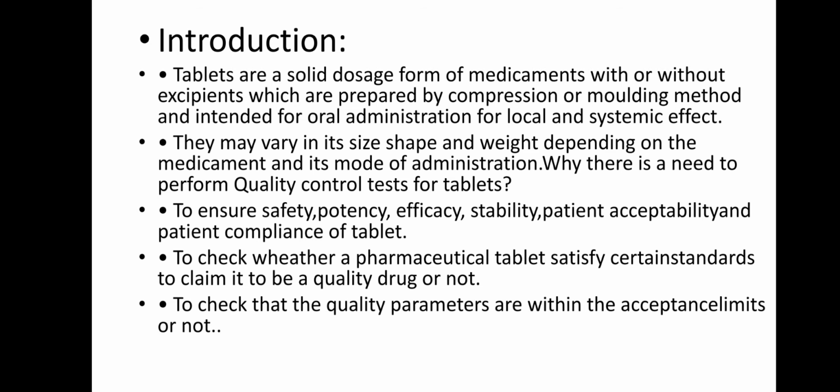Why is there a need to perform quality control tests for tablets? To ensure safety, potency, efficacy, stability, patient acceptability and patient compliance of the tablet, to check whether a pharmaceutical tablet satisfies certain standards to claim it to be a quality drug or not, and to check that the quality parameters are within the acceptance limits or not.